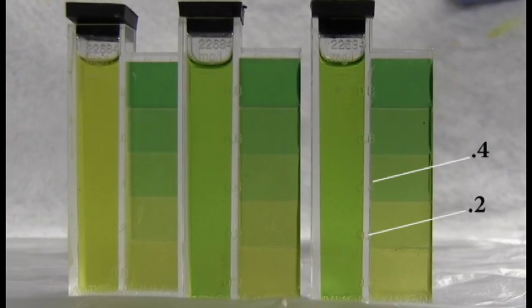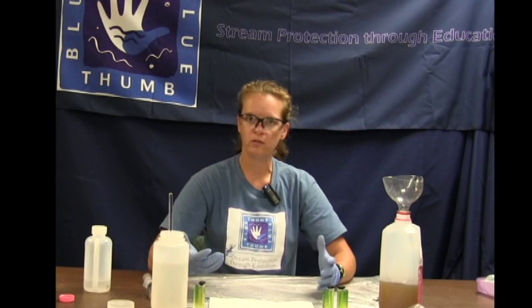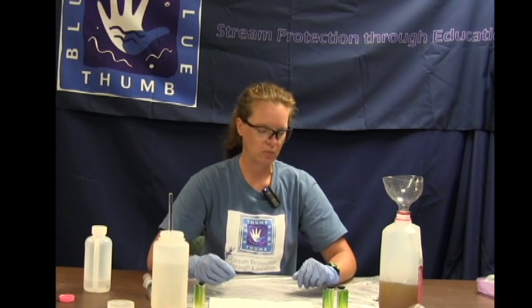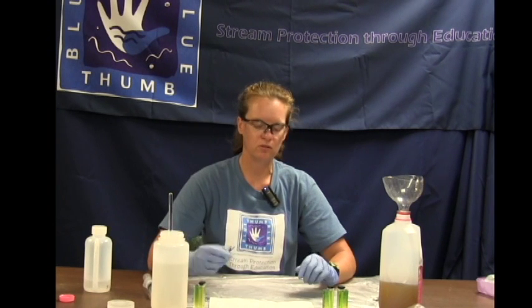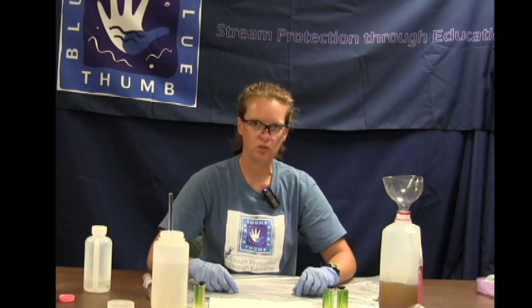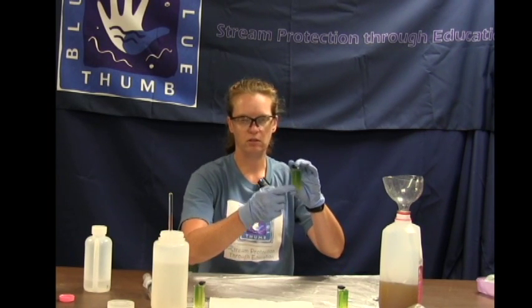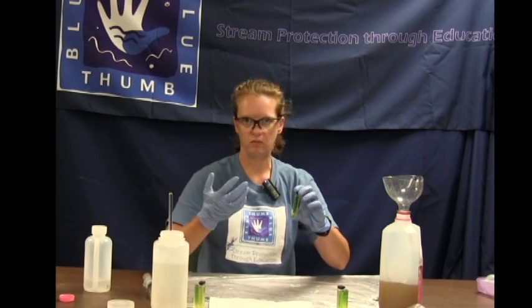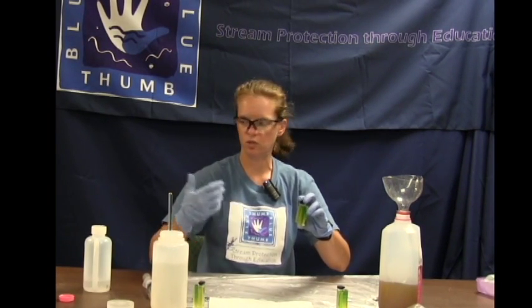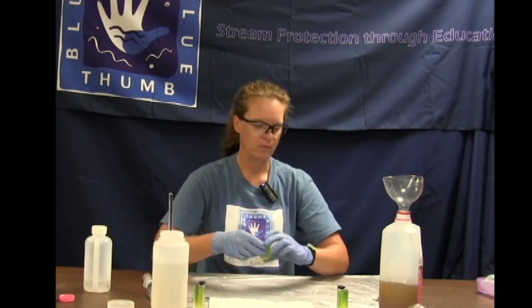So again, as far as repeatability, you want them to be about 0.1 difference at most, but really they should come up to be about the same. If not, do a third test and see how it goes. Hopefully 2 of them should get good repeatability. So pretty much, what you read on the cube is going to equal the milligrams per liter. That being said, if you need to do a mid or high range, which is written in the instructions, there is going to be some calculations along with that.